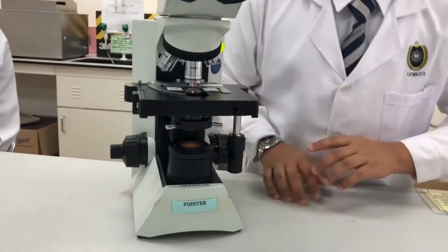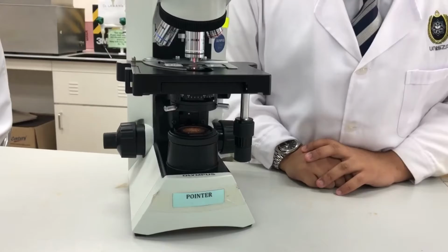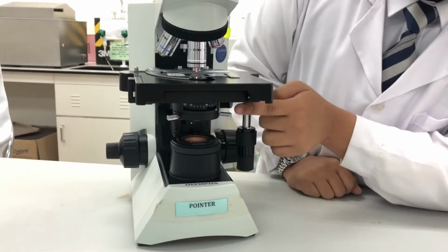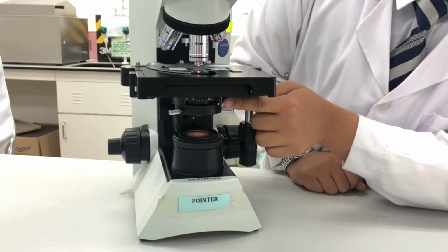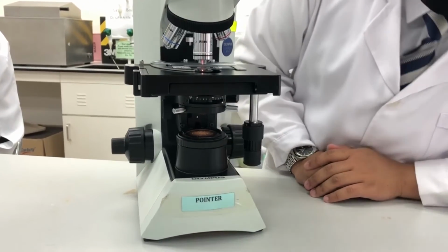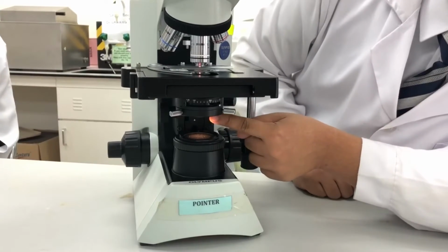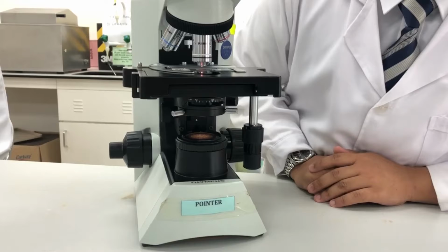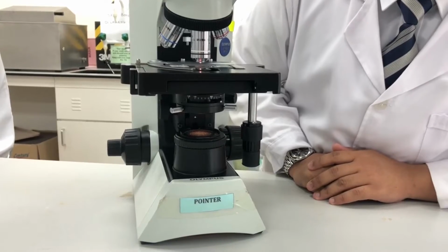As you can see, this is the diaphragm. It's also known as the iris. It's found under the stage of the microscope, and its primary role is to control the amount of light that reaches the specimen. As you can see, this is the condenser. These are lenses that are used to collect and focus light from the illuminator onto the specimen.